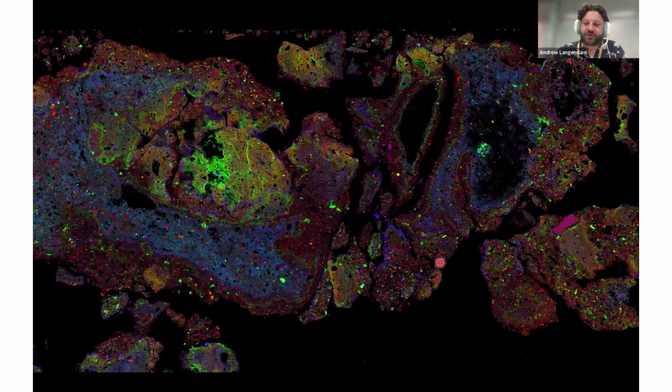Also, here's a gratuitous, very pretty image that Gordon and Tom Jones allowed me to use. This is some mine tailings from Princess Creek in Tasmania. And here you can see mobility of different elements that are being moved around by the weathering of these tailings at different rates. So in this image, iron is in red, copper is in green, and zinc is in blue.